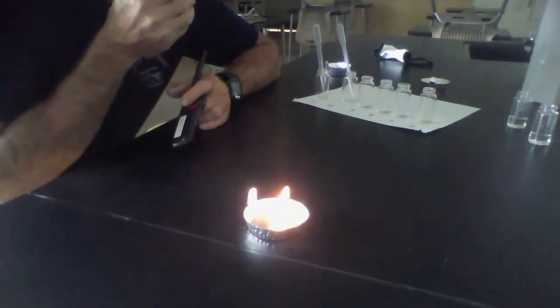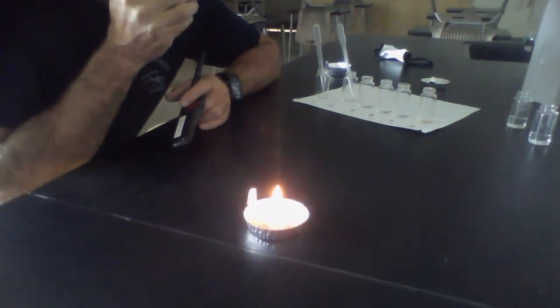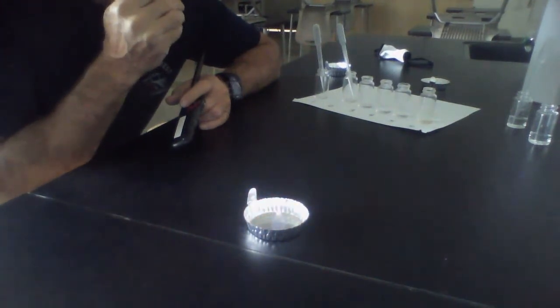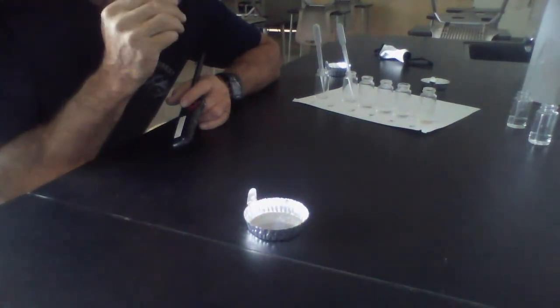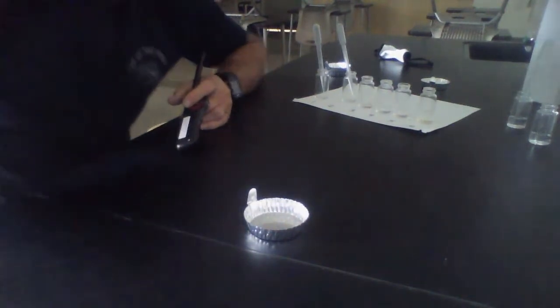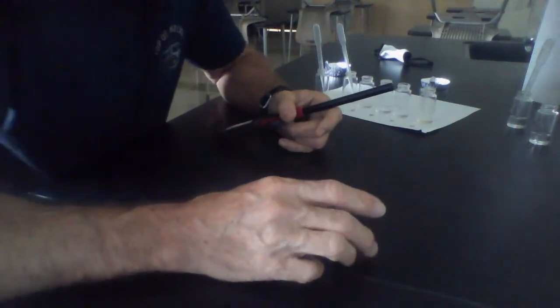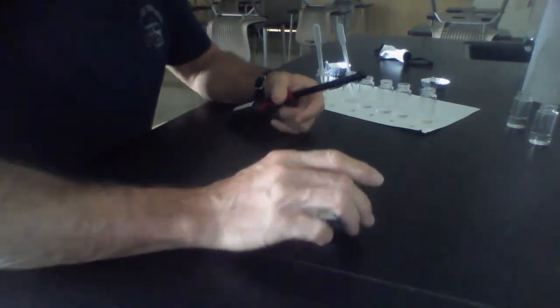Candle effect. But not really bouncing around a lot, staying still. 3, gone. Had that candle thing going on where it moved around a little bit. Not a ton, but moved around.